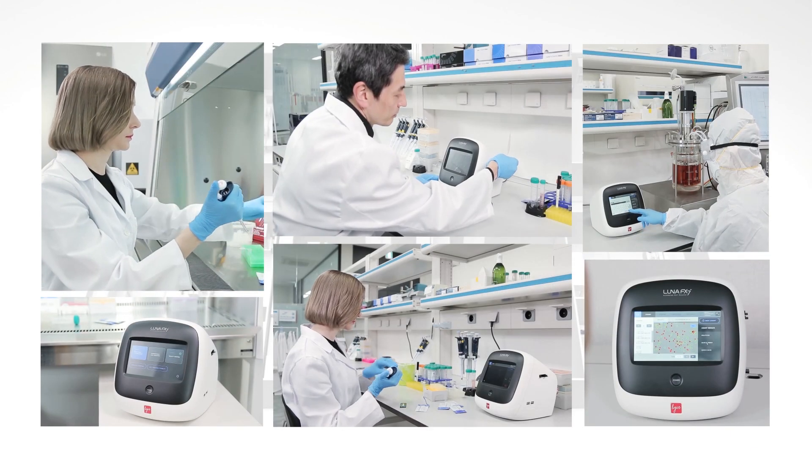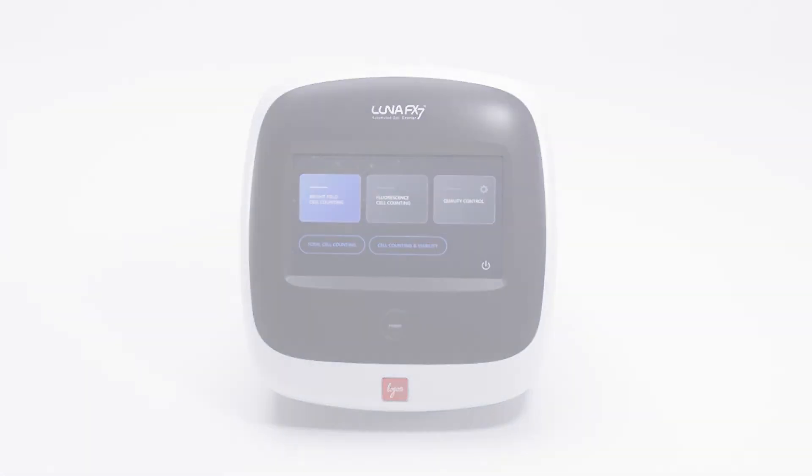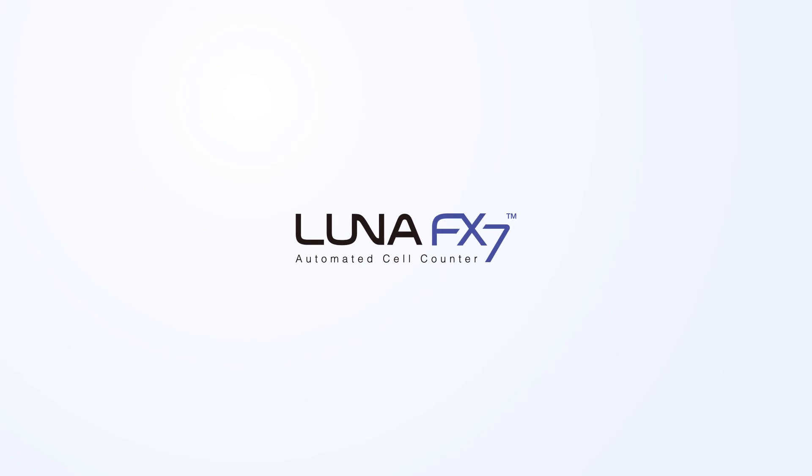The LUNA FX7 is an all-purpose cell counter designed to meet just about any cell counting application. Better counts for better science.